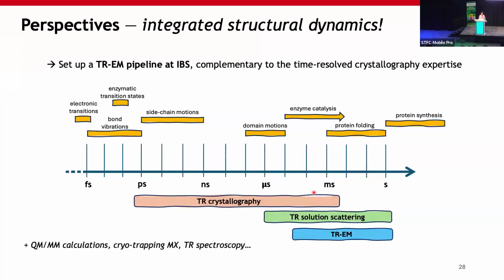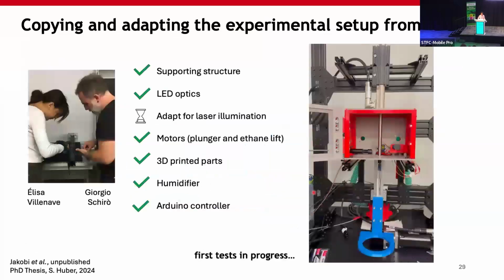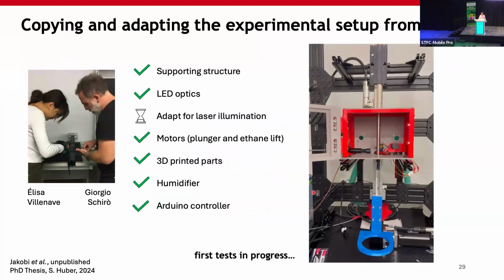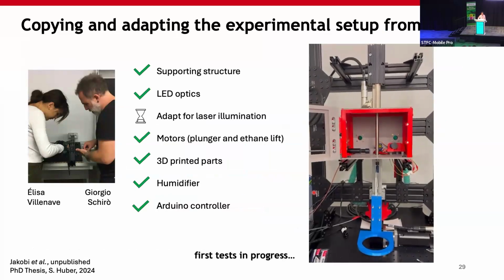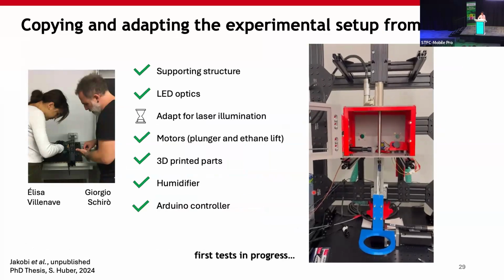And our goal at IBS now is to set up time-resolved cryo-EM to be complementary to our time-resolved crystallography expertise, especially on light-sensitive proteins, but not only, because we can work with caged compounds. And for this, I am copying and adapting the experimental setup that we used in Delft. And I'm doing the first test at the moment, and it's starting to work like a plunger. So I'm hopeful for it.